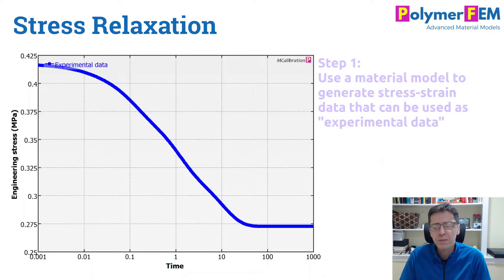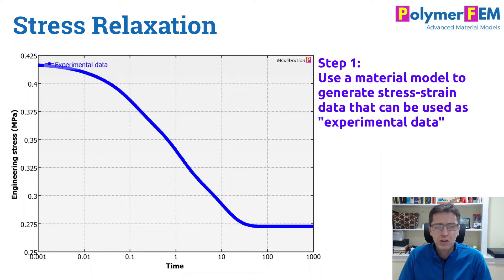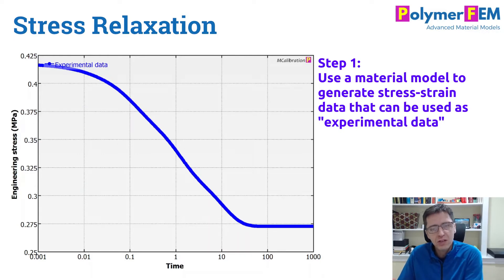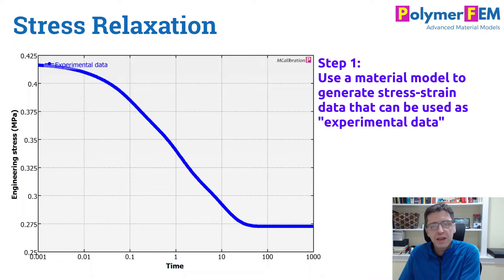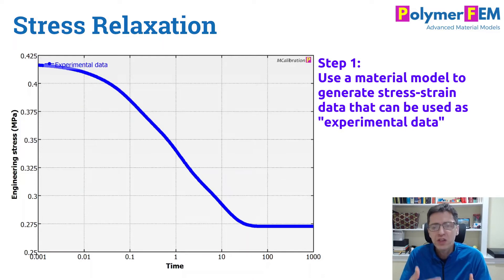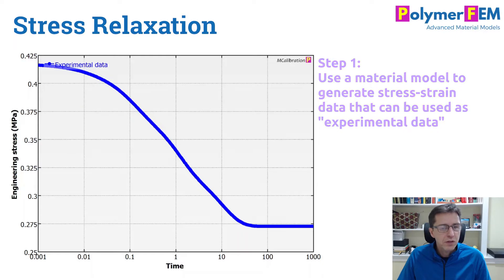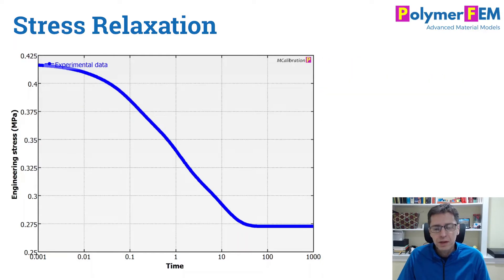So the first step is I'm going to generate the stress relaxation data using MCalibration with a known material model. That is the data I'm then going to go try to fit a material model to. By generating the data in a known way, I can then go back and see if I can recover the original material model that I used to generate it. That's how I'm going to check what is important and what's not important in this case. Let's get started and first generate some relaxation data.